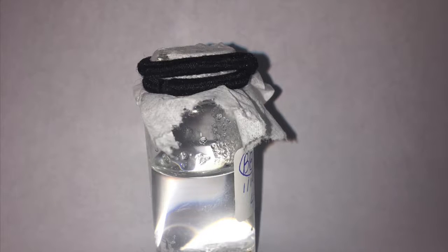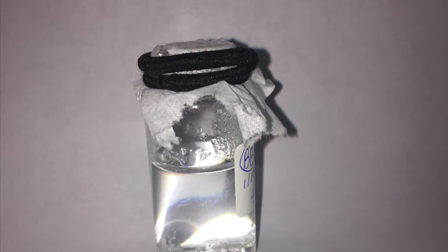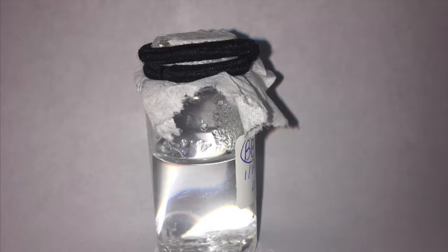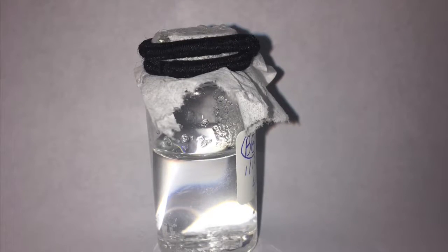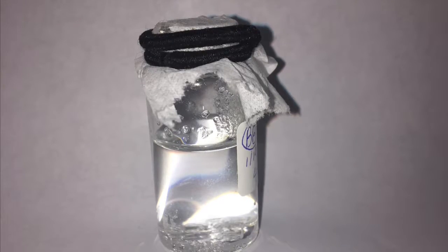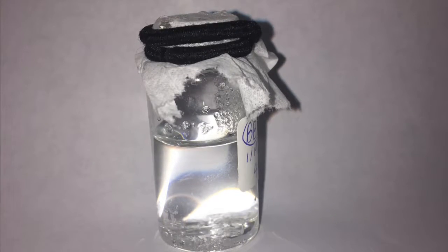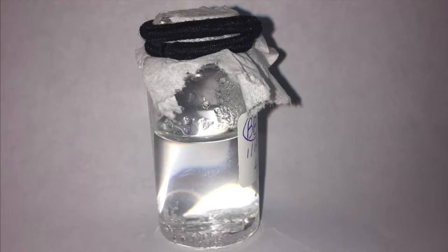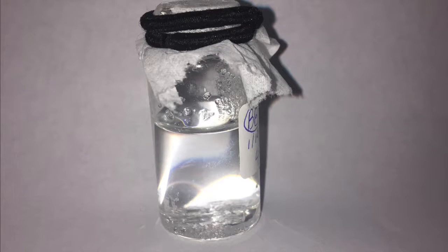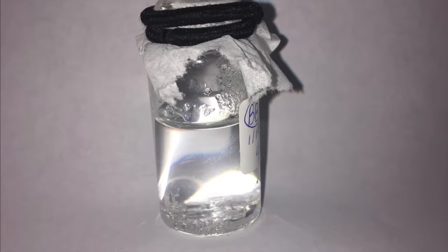There is another crust of crystals toward the top of the vial above the water line. I find this slightly unusual because I was not expecting crystals to form at such a high position in the vial, because I assumed that the crystals would be more likely to nucleate at the bottom due to gravity. These crystals may be stuck up there because the solution evaporated quickly from the top while the vial was near the lab lamp, or its original location.